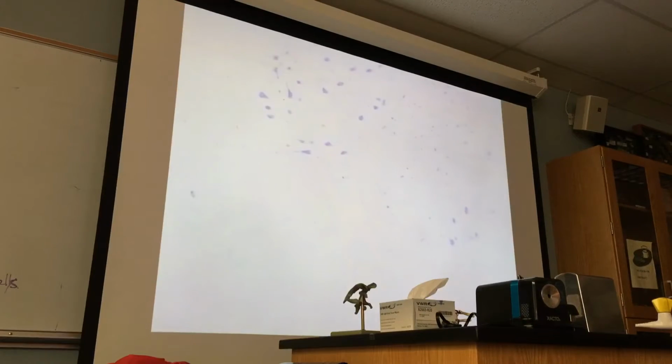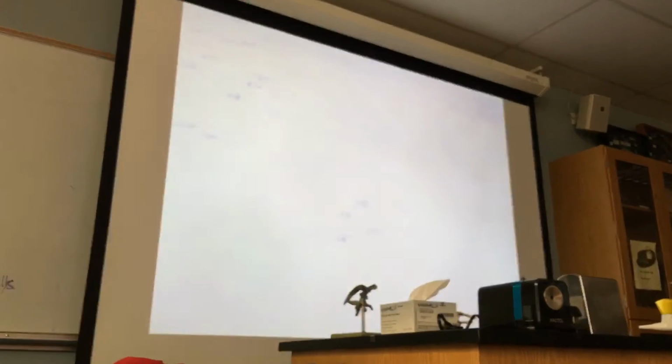You can see the neuron cell bodies. There are several others here too. But I will focus over here because it looks nice. Let's go to next higher magnification.